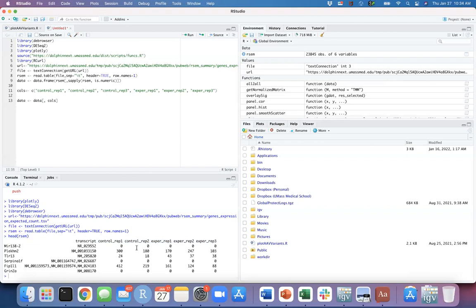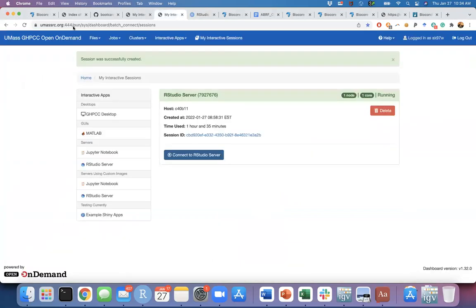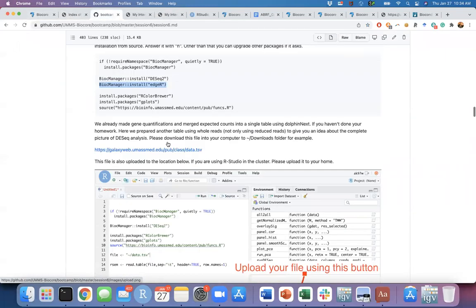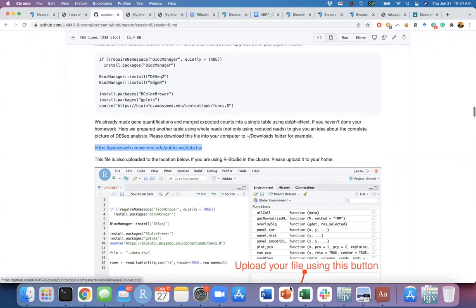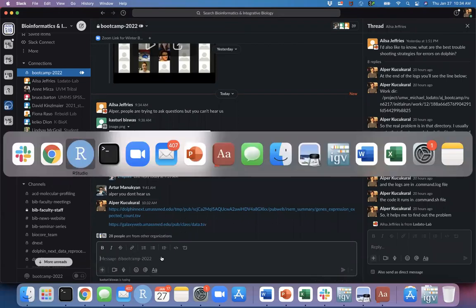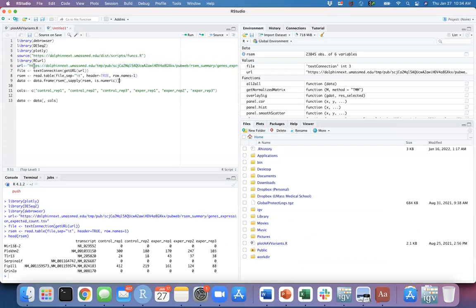And what I'm going to do now, I'm going to change this to something that I want to use. Don't use that one, because, sorry, I realize one column is missing there. So use the one in the bootcamp, this one. Let me fix this. Please use this one, because that one has one column, one sample, missing. Okay, so where was it? Here. I'm just going to change my URL.